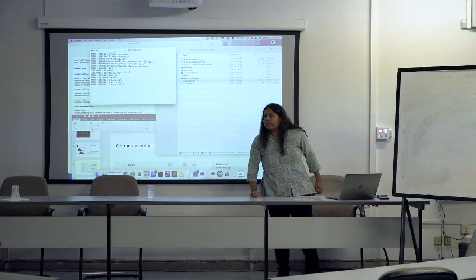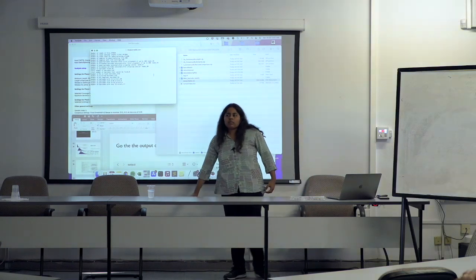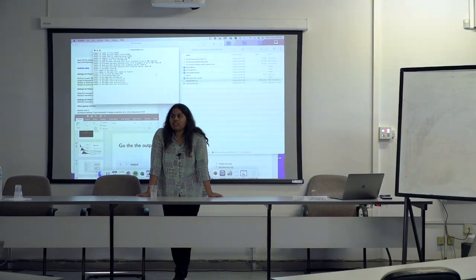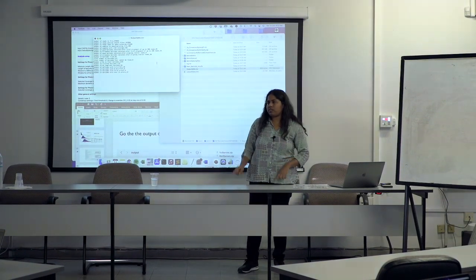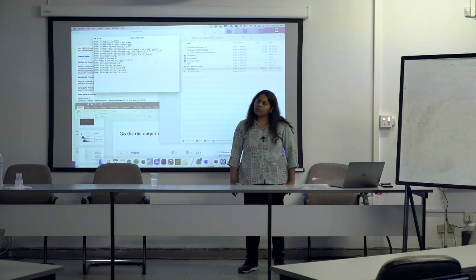Again, to the point that you made at the end, you mentioned that there can be a difference of 2 or 3 barcodes depending on the read. Yeah, so the read subsetting is a random process. Let's say you have a very similar set of reads, it's going to take a random 50 that are most similar in length. That random process can create slight differences in the number of reads. If I run the same data set 2, 3, 4, 5 times, I may get slightly different results, possibly.